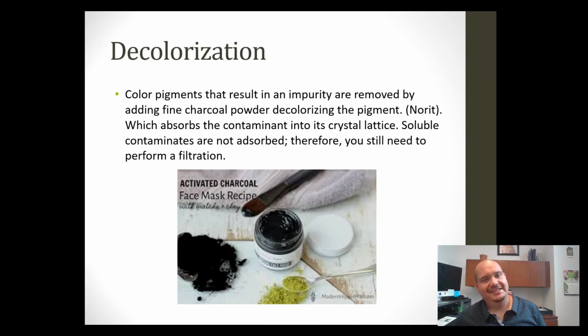And finally, we're going to talk about decolorization. Decolorization is done with charcoal. Some of you might have seen black water.